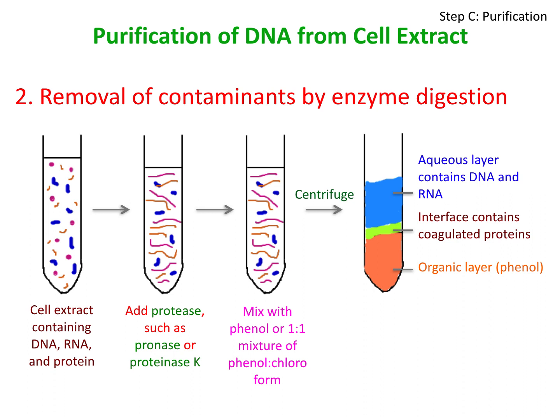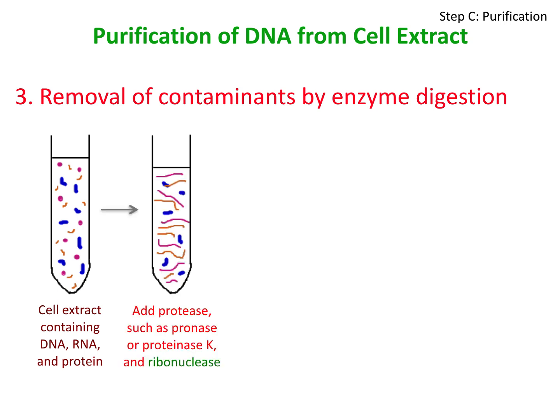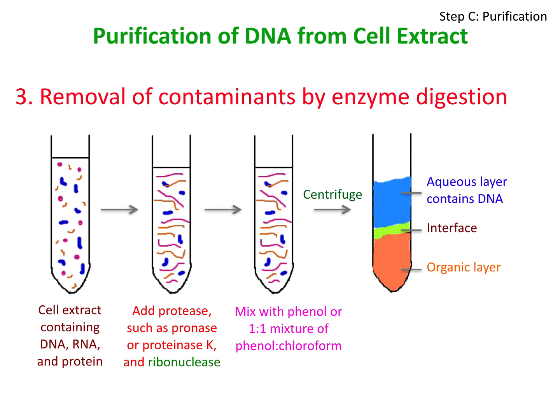Now again, the next problem is we want only DNA to be present in the solution. So how to remove this RNA? Yes, you guessed right. Again, the answer is enzyme digestion. A few of the messenger RNA or mRNA molecules are removed by phenol treatment itself. But to completely remove the RNA, the most effective method is treatment of the cell extract with ribonuclease. Just like protease treatment, ribonuclease treatment is also performed before extraction with phenol. Ribonuclease degrades the RNA molecules into small ribonucleotide subunits. And finally, after phenol extraction, we get pure DNA in the aqueous solution.